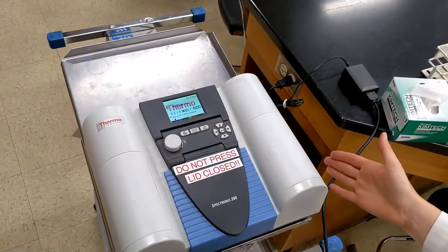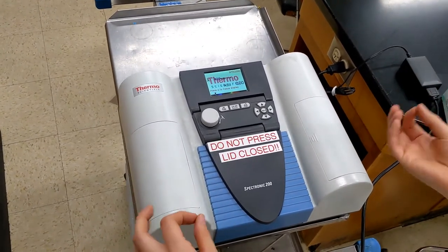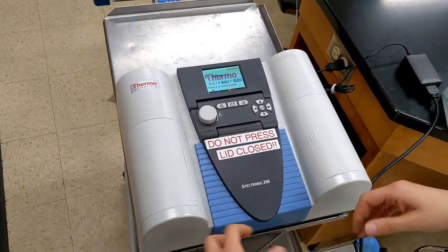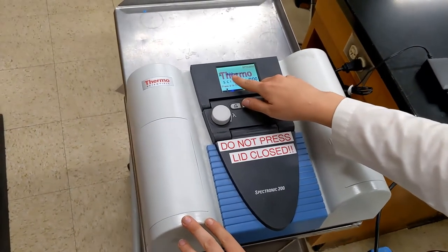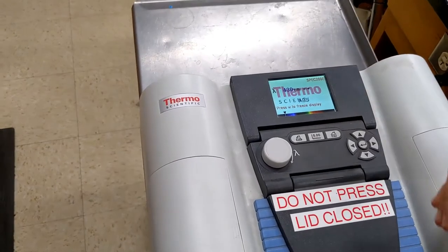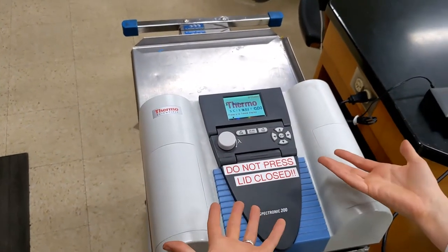Here we have our spectrophotometer. We are using absorbance, or OD — optical density — which measures how much light is absorbed by our solution. We have this set to 430 nanometers, which relates to the wavelength of light. You will need to change this depending on what you are testing.